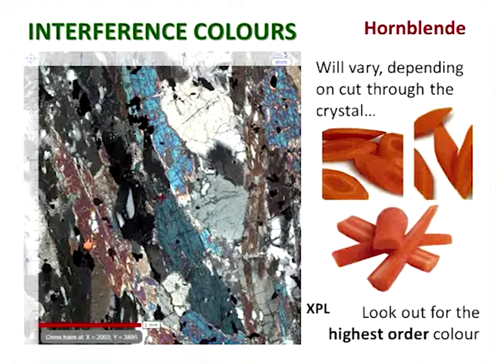So the key thing when on your mineral identification chart it says that muscovite or that hornblende has second order blue colours, of course not all the crystals will have that in your thin section. They will run right the way from, you know, a low first order grey like this one in the middle here, right the way up to somewhere near this second order blue colour.